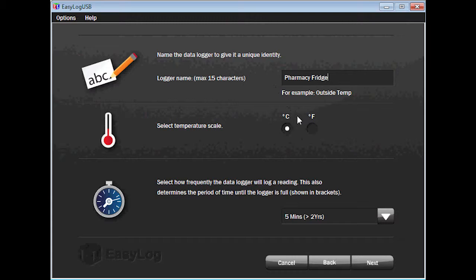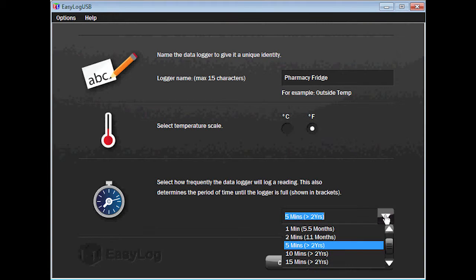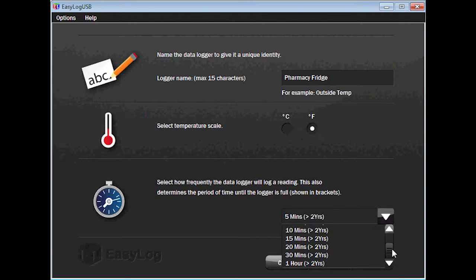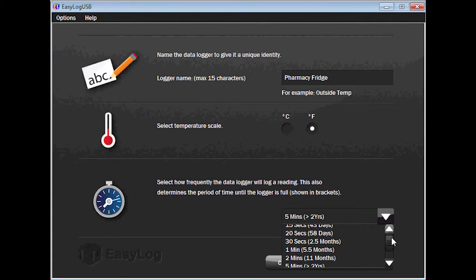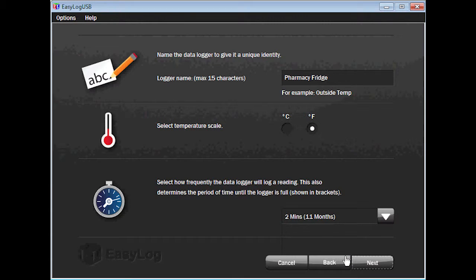Next, choose the unit of measure you wish the data to be recorded in — Fahrenheit or Celsius. I will choose Fahrenheit. Lastly, using the drop-down arrow, choose how often you wish to have the data recorded. Notice the more frequent the device records the temperature, the shorter the time it takes to fill the memory of the device. I will choose to read the temperature every two minutes. If you're happy with your settings, click Next to proceed.